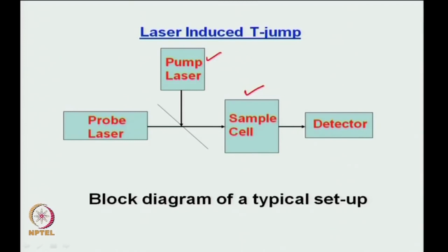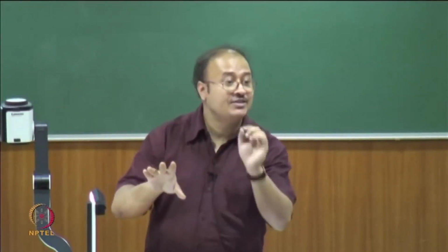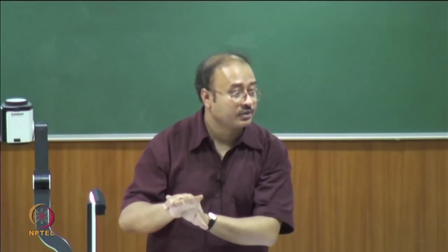Okay, you have to do a temperature jump. That means you have to increase the temperature. The pump laser is such that you have your protein in buffer. The sample, I am not telling you which part, but the sample absorbs the laser. The sample absorbs the laser radiation of the pump laser.